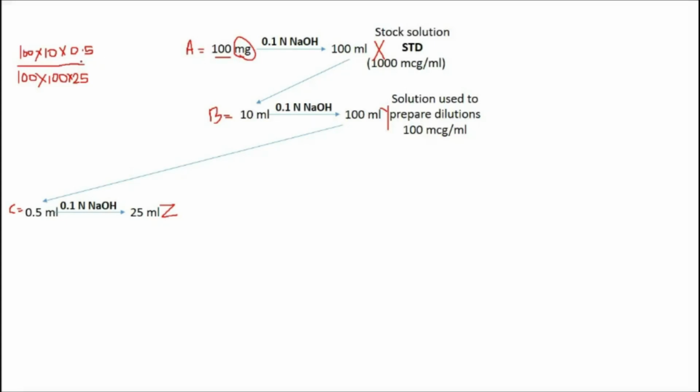So I will multiply numerator by 1000 to convert milligrams into micrograms. Now, let us calculate. 50 divided by 25. I will need a calculator now, it is very difficult. So it becomes 2 micrograms per ml.